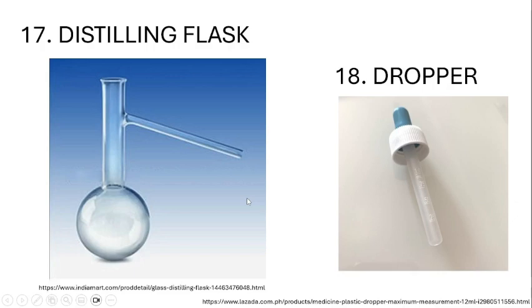Okay, so it is part of the distillation setup, and this part here is called the neck. So neck. Then this is the side arm.